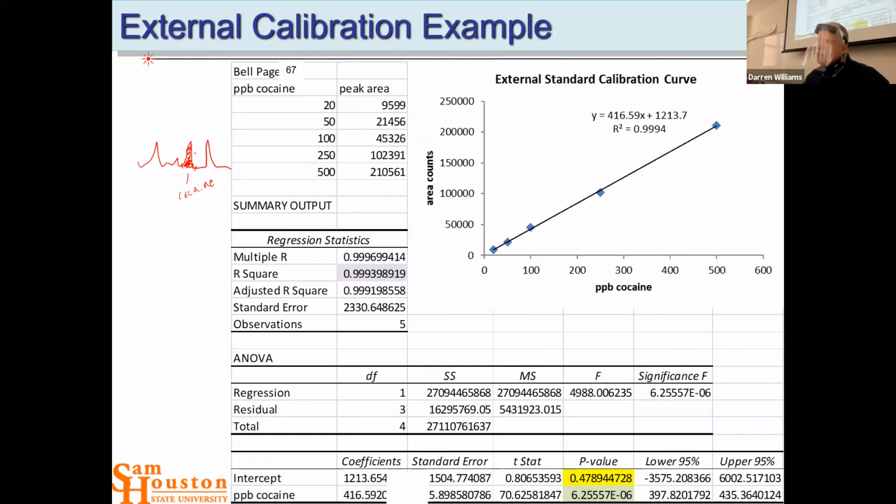And so a lot of this is automated. You load up the tray with your standards and your check sample, and you say go, and you've built this standard analysis method in the ChemStation software or whatever package you're using, and it will integrate those peaks automatically, produce an output table. It's fantastic. And so these are the integrated areas under those peaks.